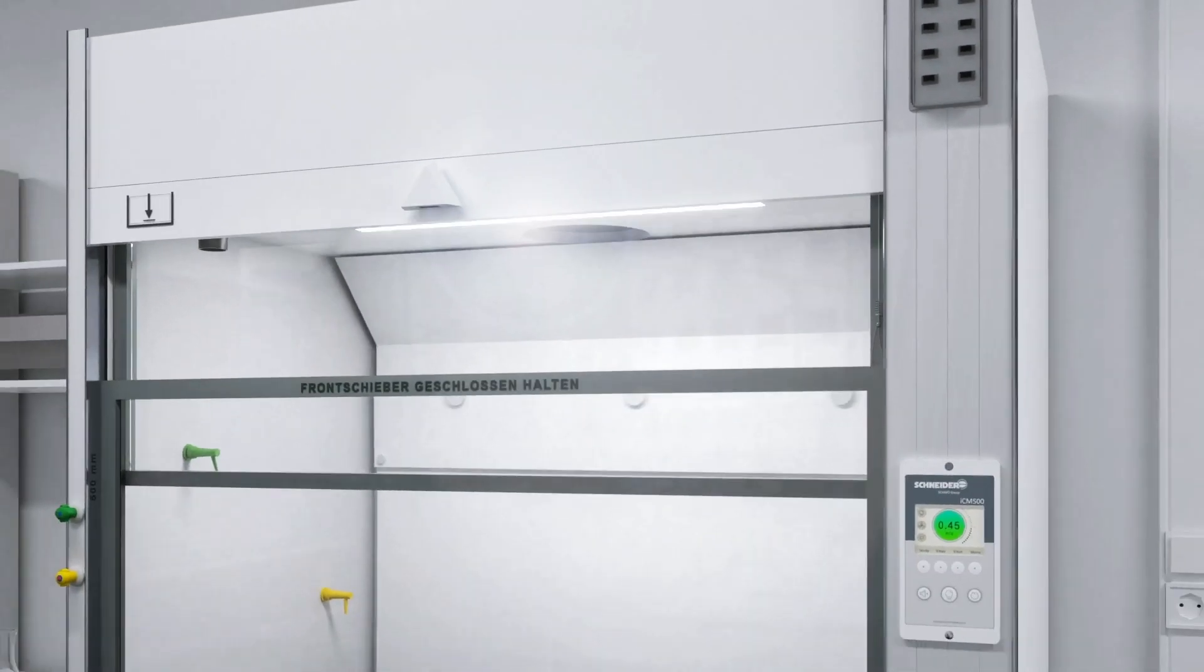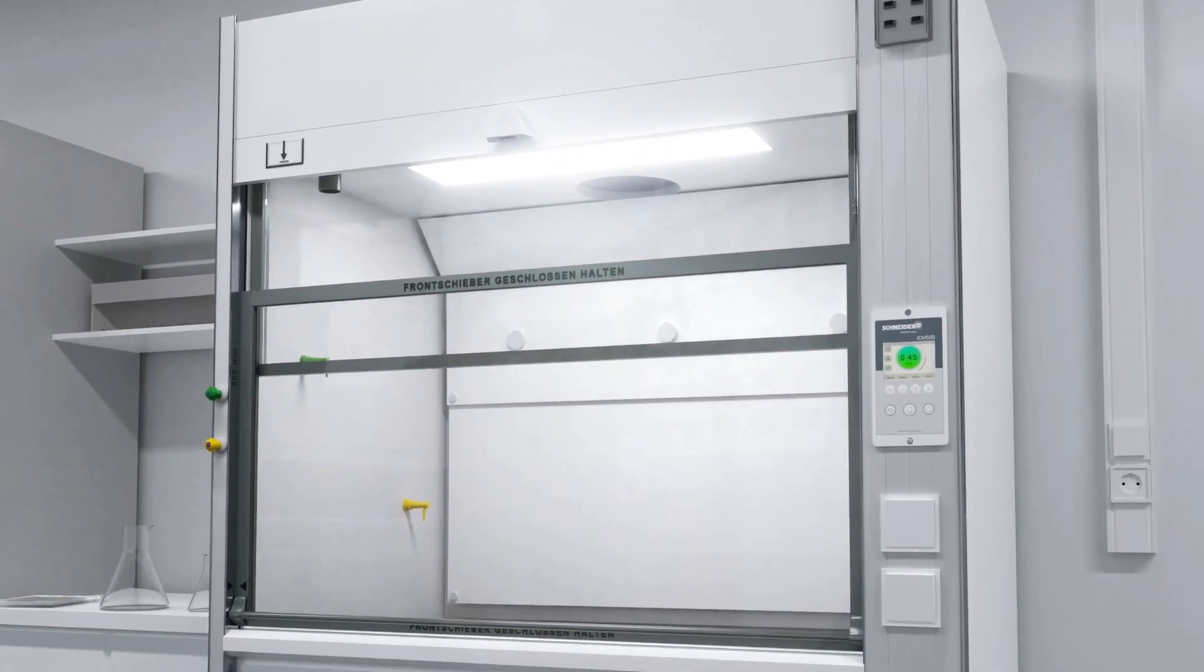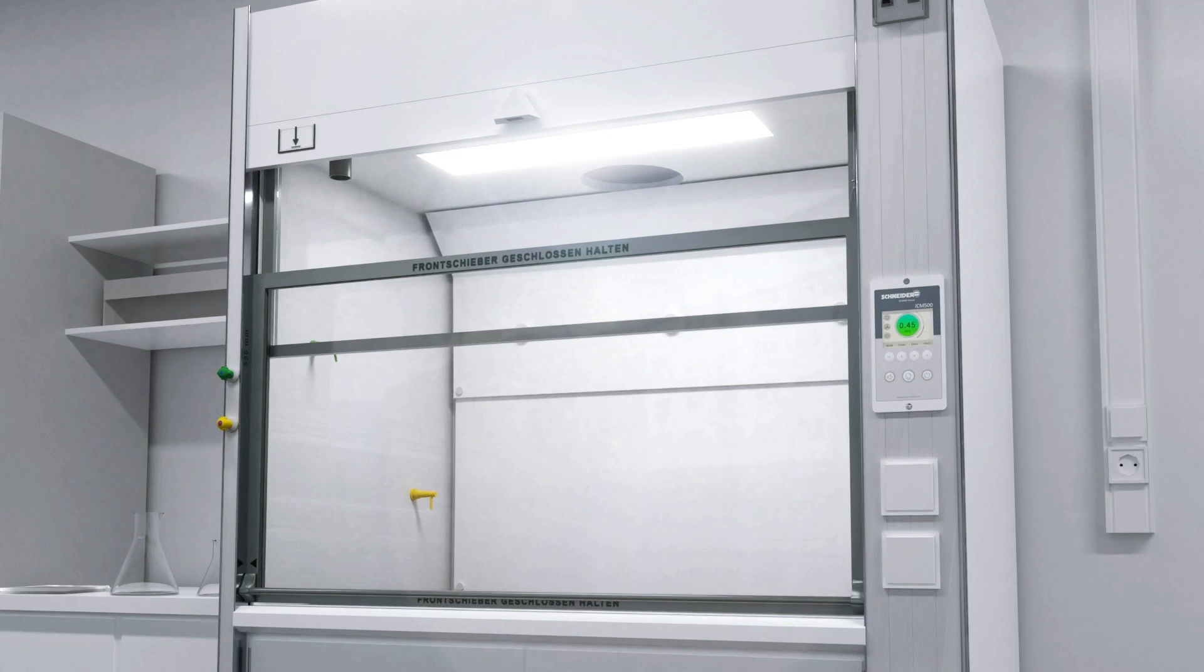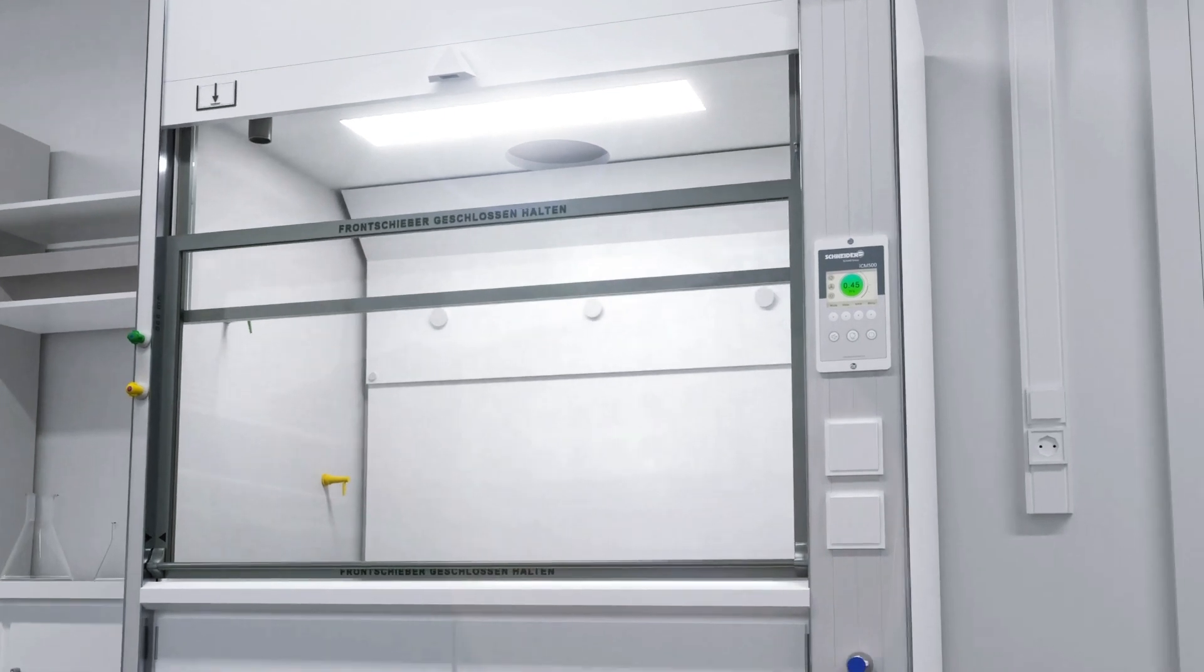In laboratories, a fume hood is a type of ventilation device to prevent exposure of hazardous or toxic gases to secure the safety of laboratory workers.